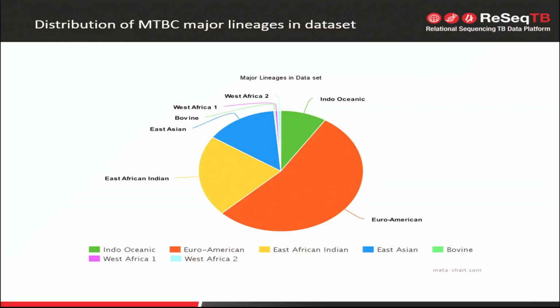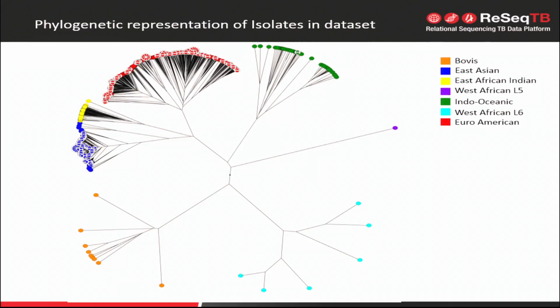So we can look at the lineage distributions, but what I also did was take some of the data that was in there, about 1,500 strains, and build a phylogenetic map using whole genome MLST, so we can look at the phylogenetic diversity within here. This shows your lineages, but also their allele calls over about 3,500 to 3,800 alleles, and I built a UPGMA tree, a phylogenetic tree, using a similarity matrix.